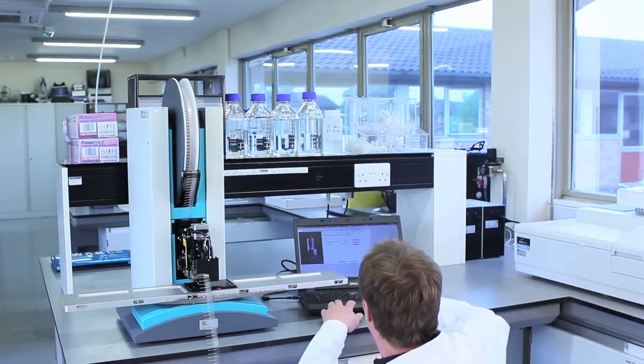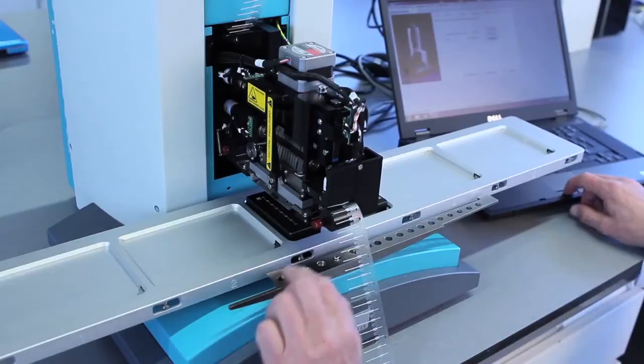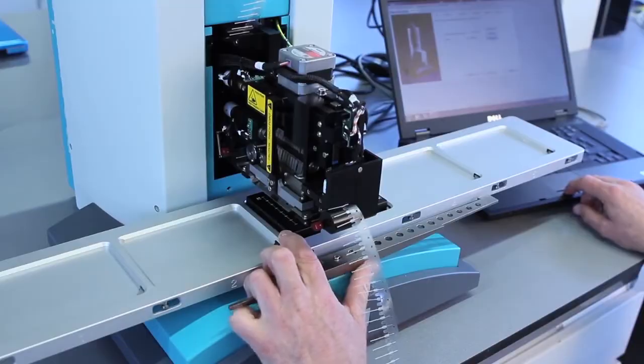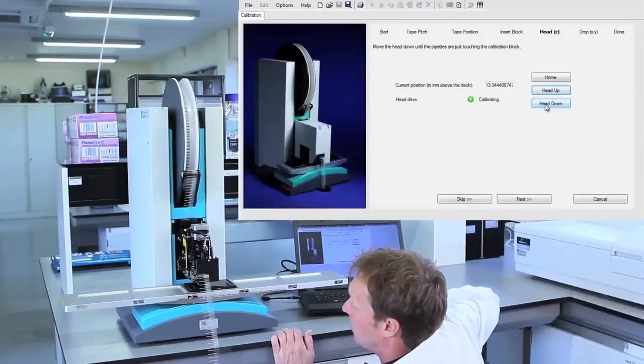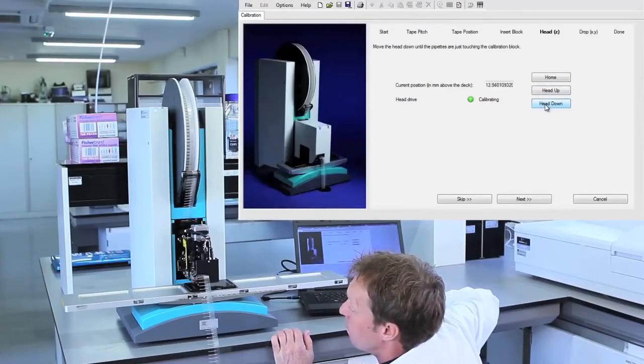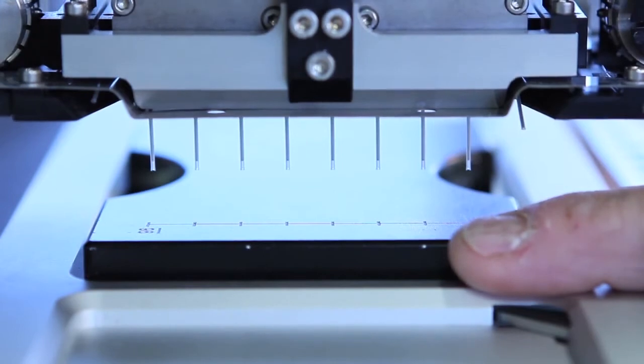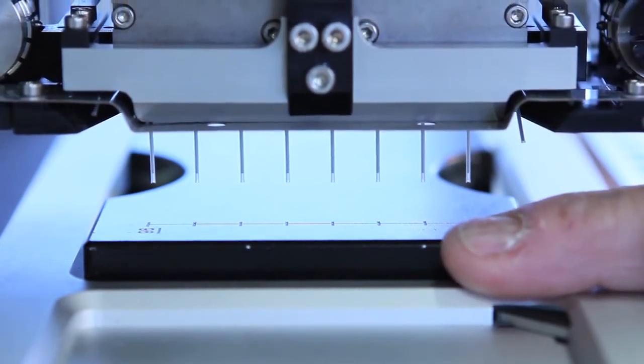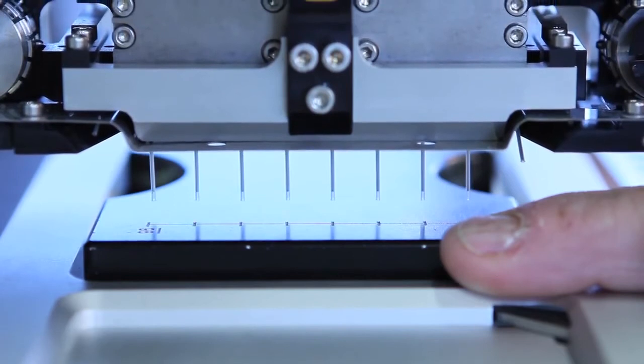We now have to drive the head down until the tips touch on the block by using the head down button. We can do very small mouse clicks to make very small moves, but we drive it down until it almost touches.